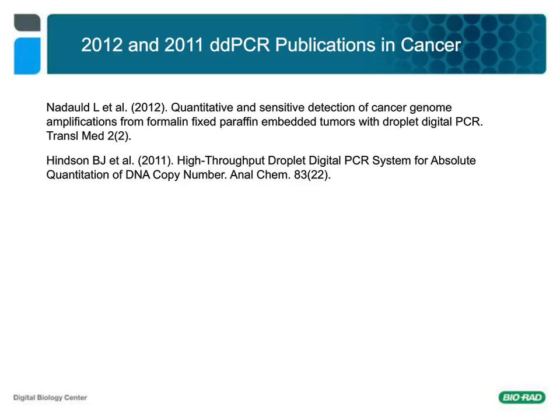Our next question is, how is ddPCR any different than any other PCR machine? What's unique about it? The main thing ddPCR can do is, in qPCR and the old-fashioned first-generation PCR, we were always guessing at how much of the initial template we were measuring.